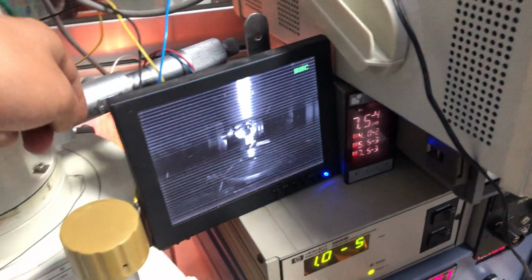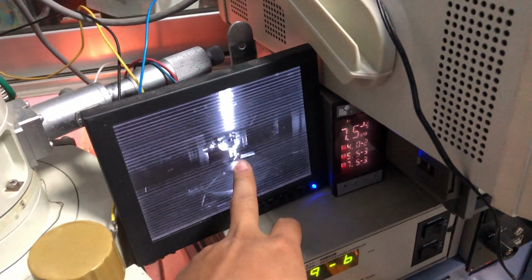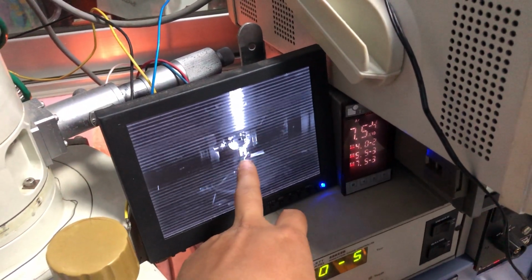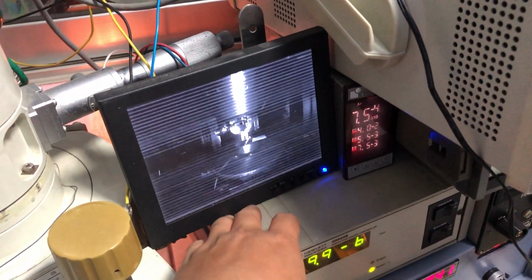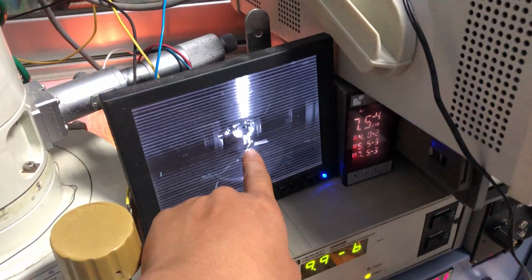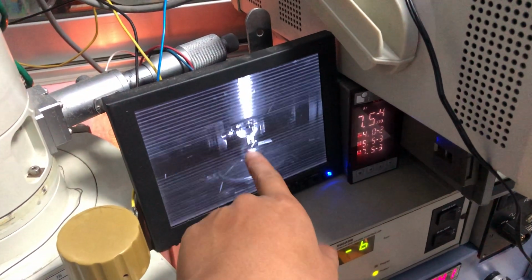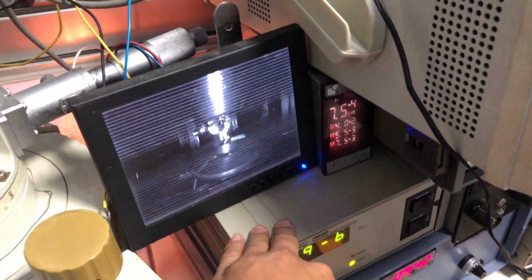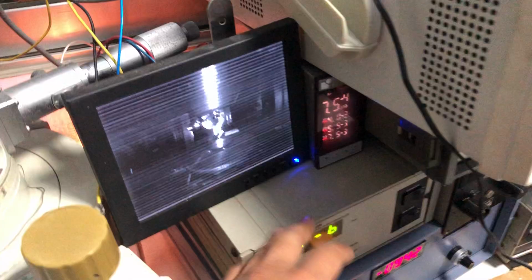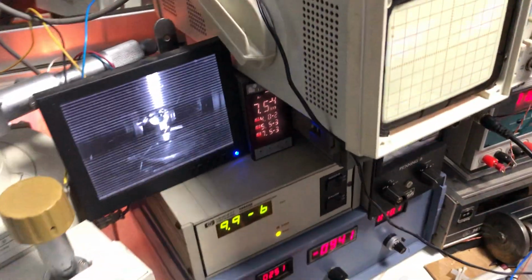Okay, here is the camera inside the sample chamber. Okay, here is the monitor. You can see here is the screw that I showed you in the last video. Okay, here beneath the screw, I've put in a light bulb filament. I also showed this in the last video.